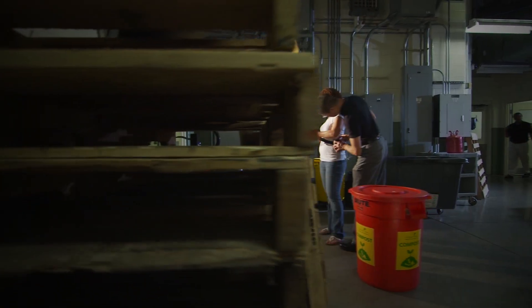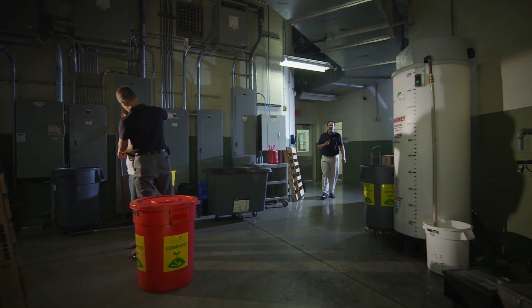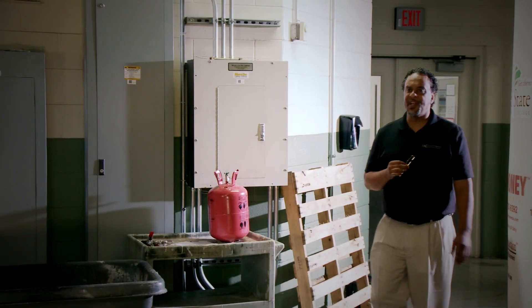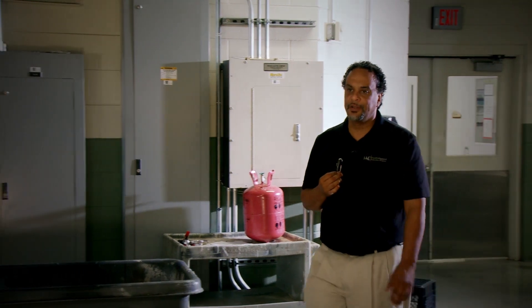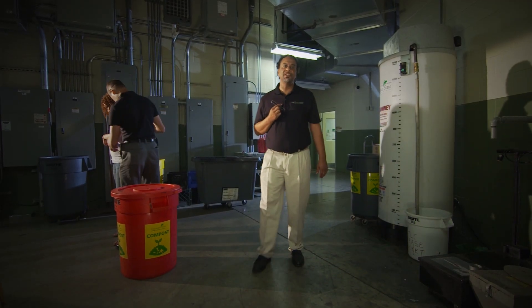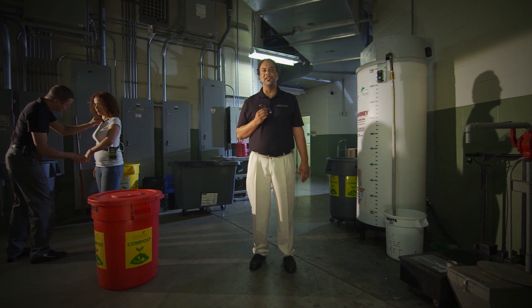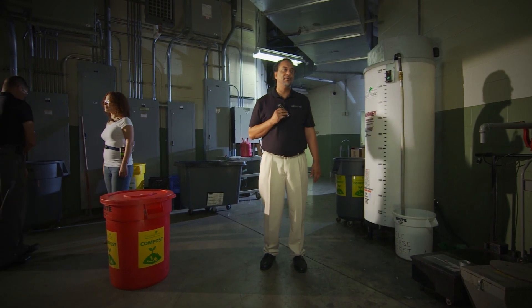Now that you know how we measure workplace exposures, you can see that we can do our work without interfering with yours. All you have to do is wear a sampler while you do your usual work. We will send the results from your individual sampler to you at the address that you provide. The data we collect from these samplers could help make your workplace safer. Let us know if you still have questions, and thank you for helping us out by wearing a sampler.